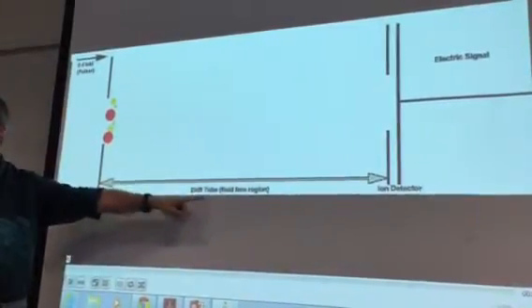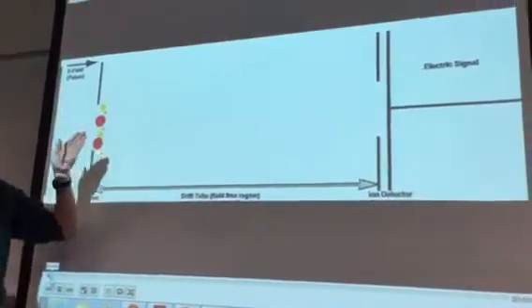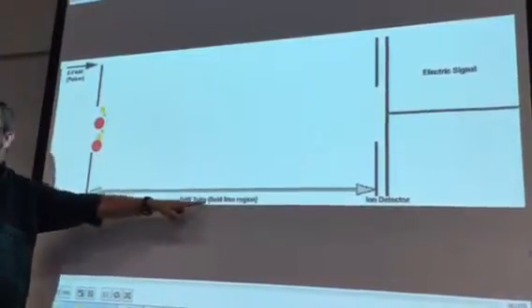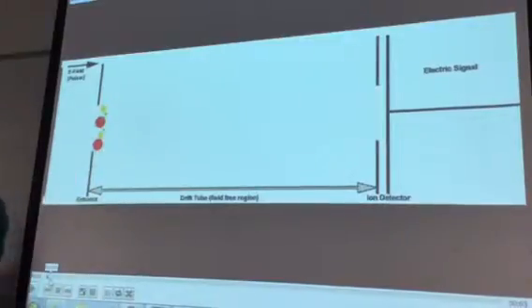They're not really drifting in the strict sense of the term, they're undergoing migration, right? They're traveling, actually no, I take that back. That would be a field. They are drifting in the field-free region, right? They have been accelerated towards the detector.